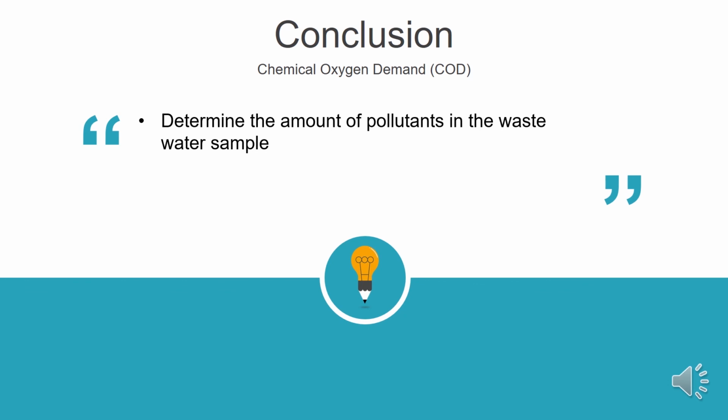Based on the result of our experiment, we found that the lake water of Lembaran had a higher COD value, which was 813.24 mg per liter, compared to the lake water of Rhydat, which had a COD value of 543.568 mg per liter.